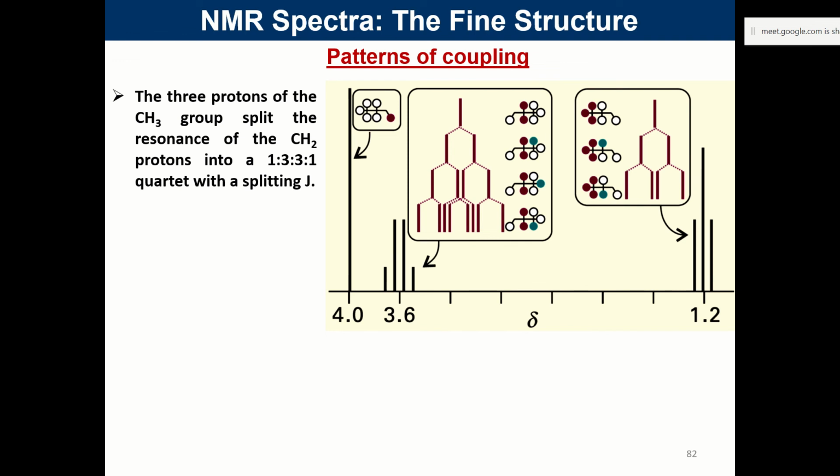So focus on CH3 group split into 3. CH3 splits into 3. So this is the triplet that you are observing clearly.